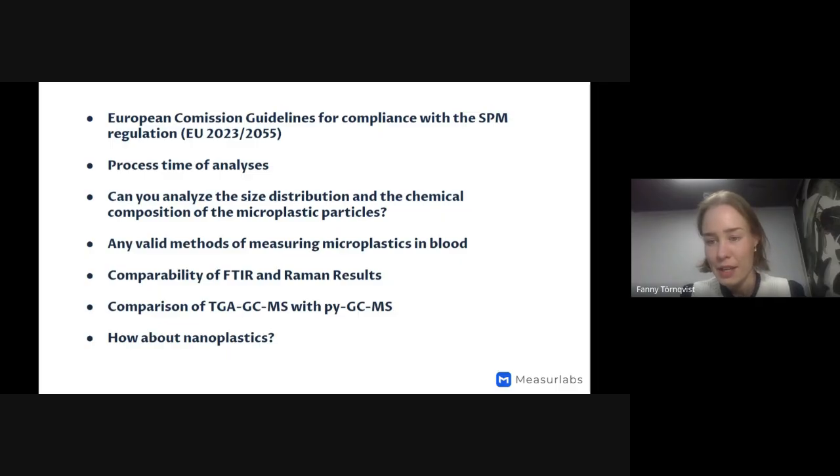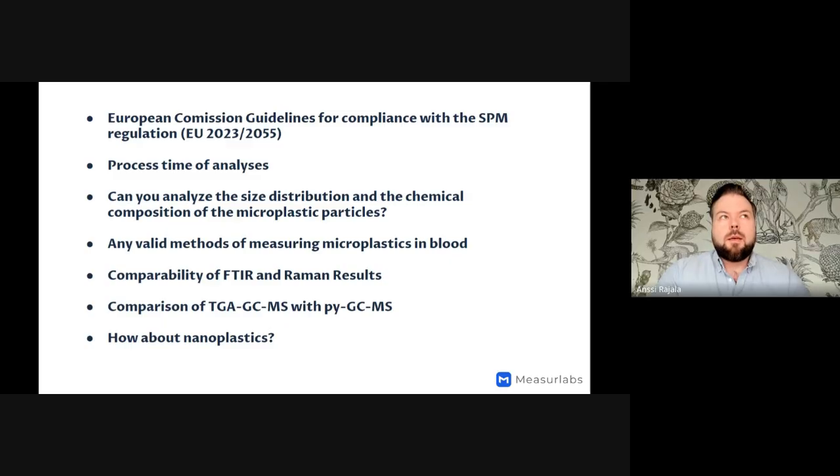Then we have the next question about soils and which would be the most suitable techniques for microplastic analysis of soil samples. For soil samples, I would say either pyrolysis GCMS or µFTIR are both well suited methods.